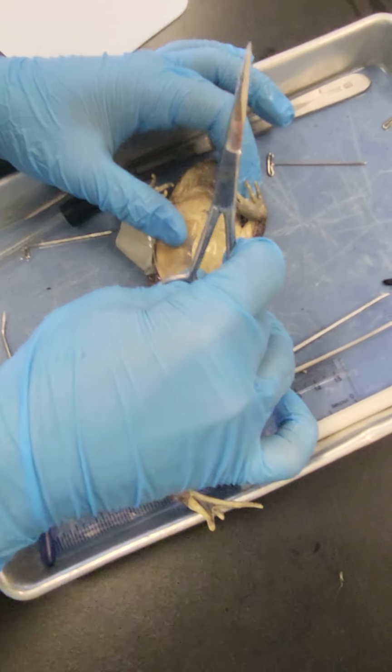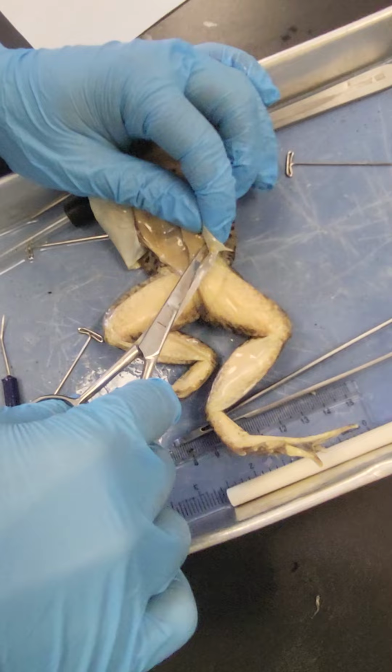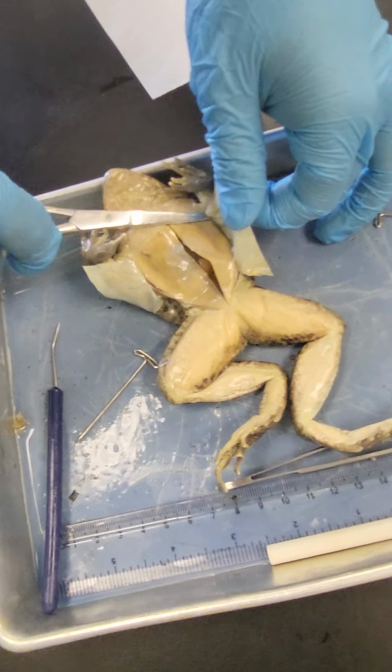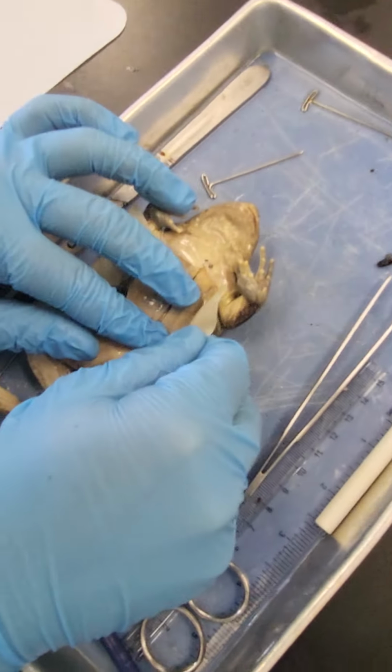It's a female. It's definitely a female. Are you sure? Yeah, that's a female. I don't know. Maybe we study frog reproduction. The one in the example looks like a male. Okay. So it's a little smaller. This one looks really big. I'm just assuming that it's a female.